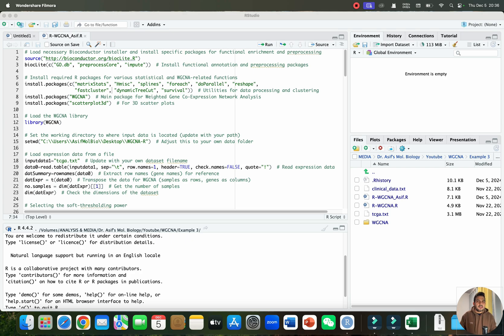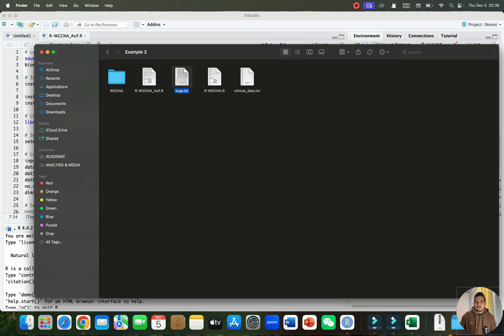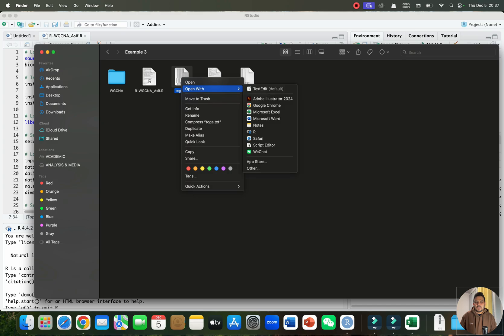Welcome to another video tutorial. In this video, I will show you how we can perform WGCNA analysis using R. I will be using two files: the first file is the gene expression file saved in text format, and the second is the clinical data, which is actually the phenotypic data of these samples.